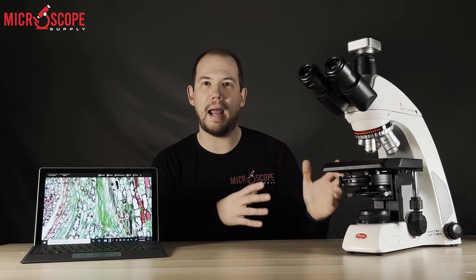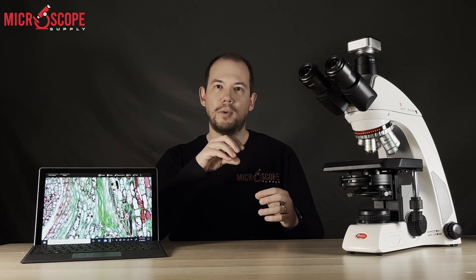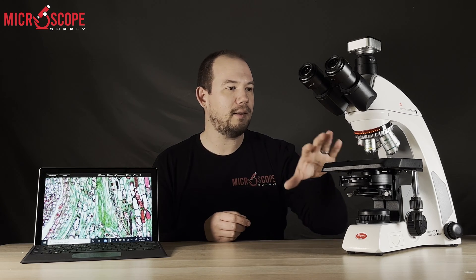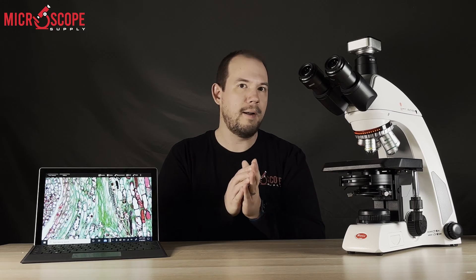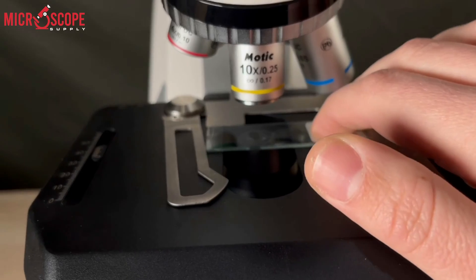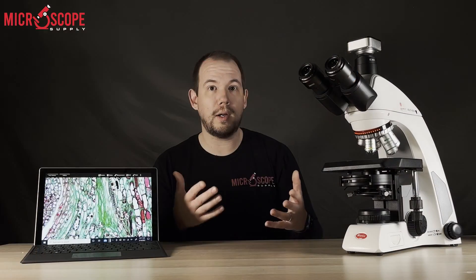The C2 comes standard with a rackless stage, which is really nice — you don't have the bar protruding from the side — as well as a double slide holder. The way they've designed these stage fingers is so that you can insert a slide with one hand, making things a little bit quicker and a lot easier.